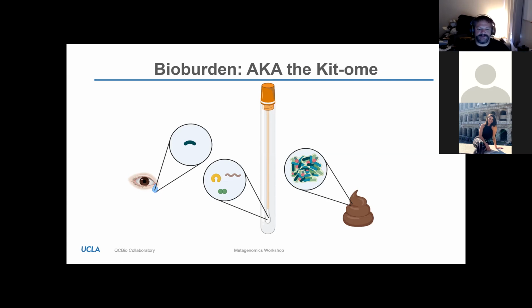And this is an issue that comes up a fair amount, especially if you're testing things with low biomass of bacteria. For example, people testing air samples, this becomes a huge issue. People testing places that should be relatively clean, such as cerebrospinal fluid, which generally should have no microbes in it whatsoever, that becomes a huge problem because then you're going to start detecting everything else.